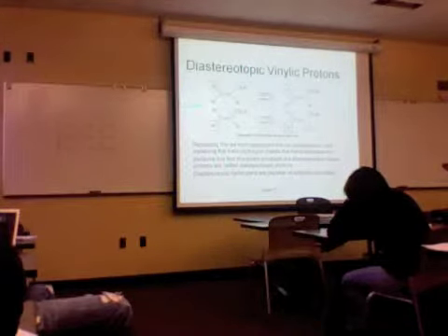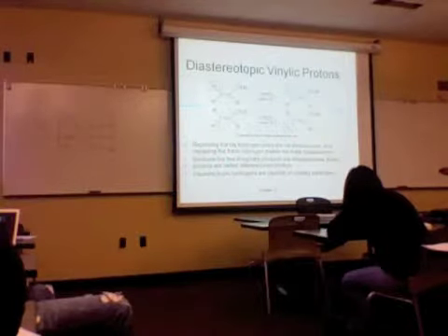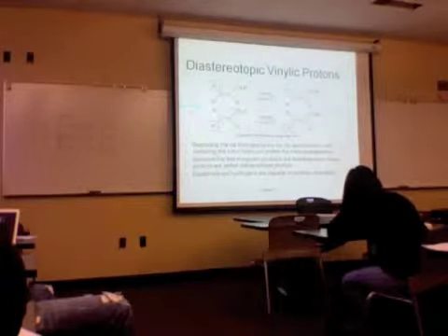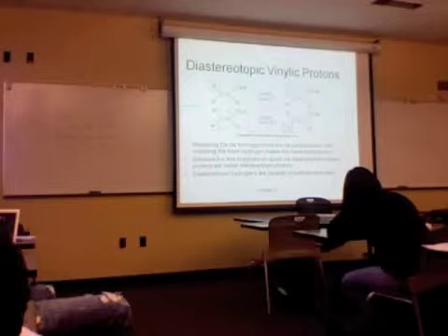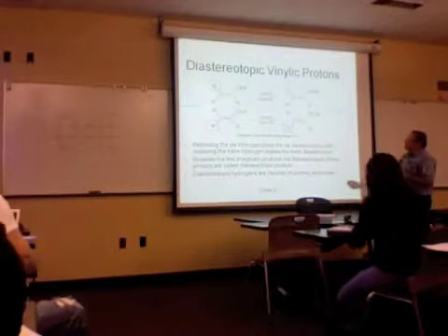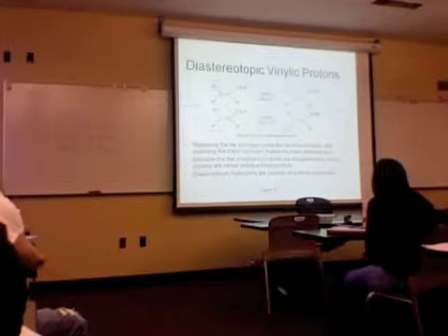is notice that type A is cis to the CH2Br. Type B is trans to it. That means that, and remember, we can't rotate around the double bond, they have different environments. And since they have different environments, they're different, and they will split each other. Does that make sense? And so we'll see geminal splitting between these two hydrogens in the structure, which will make it look a little more complicated. This is just a mental test to help us recognize that they really are different.